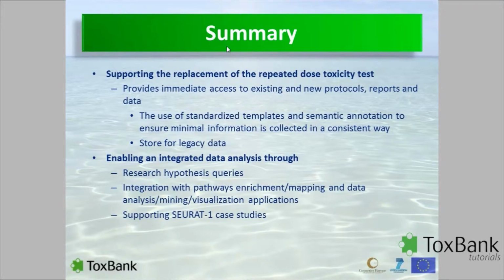It uses standardized methods to represent the data, in this case the ISA-TAB Universal Data Exchange format. This ensures that minimal information is collected in a consistent way to support an integrated data analysis. The warehouse also provides long-term storage for the information to make it accessible to researchers over time.